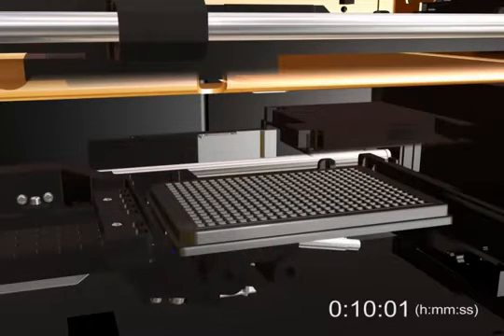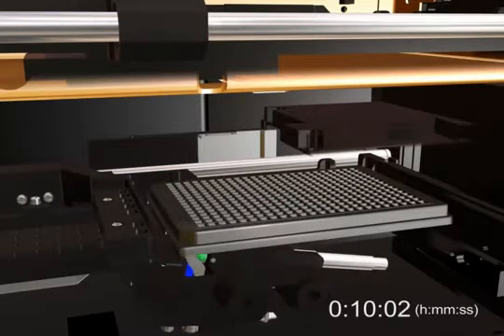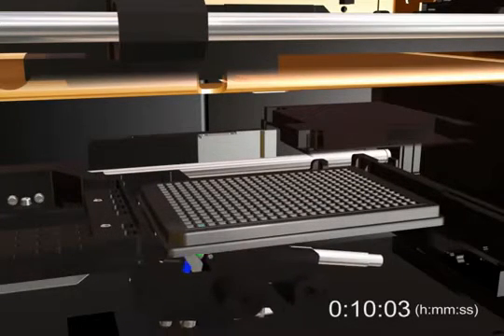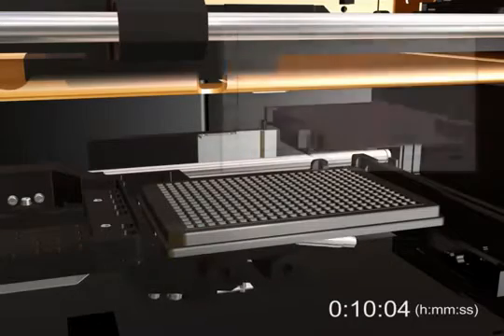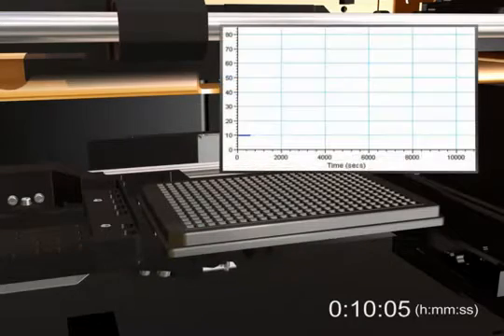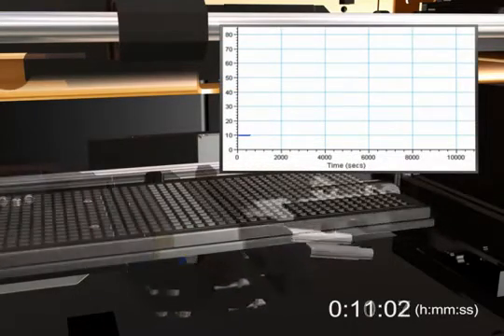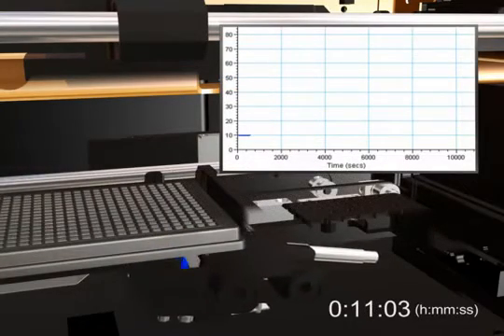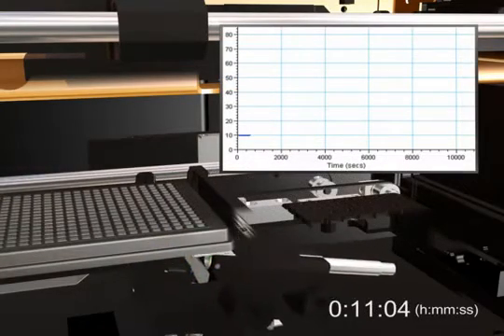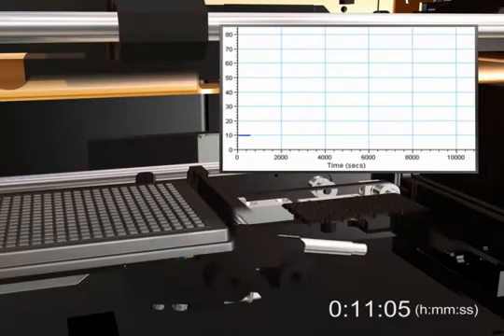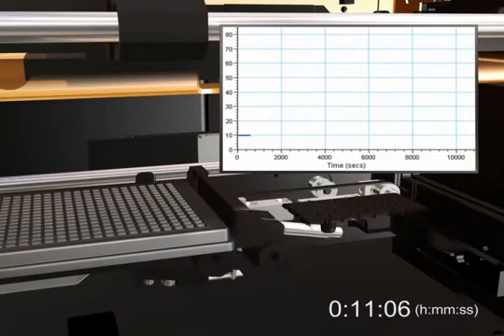At 10 minutes, we have reached the end of our next kinetic interval and are beginning the next read. Additional data points are now displayed in the well graph.